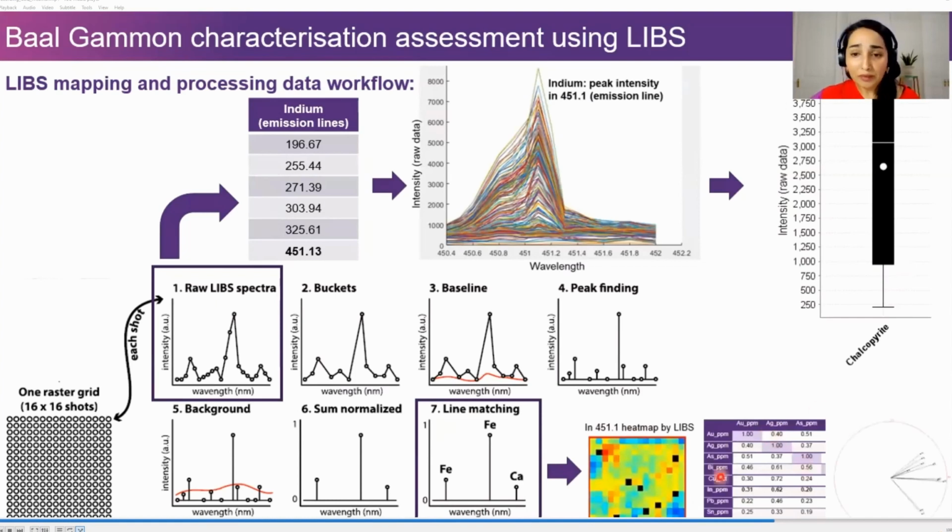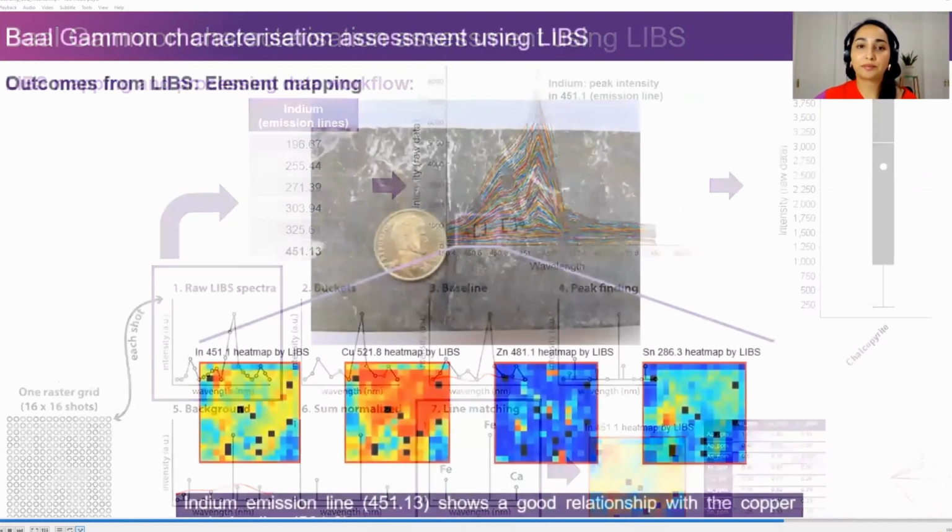It wasn't included as part of this research, but you can use this normalized data to create correlations and use, for example, a Pearson matrix and also a principal component analysis.